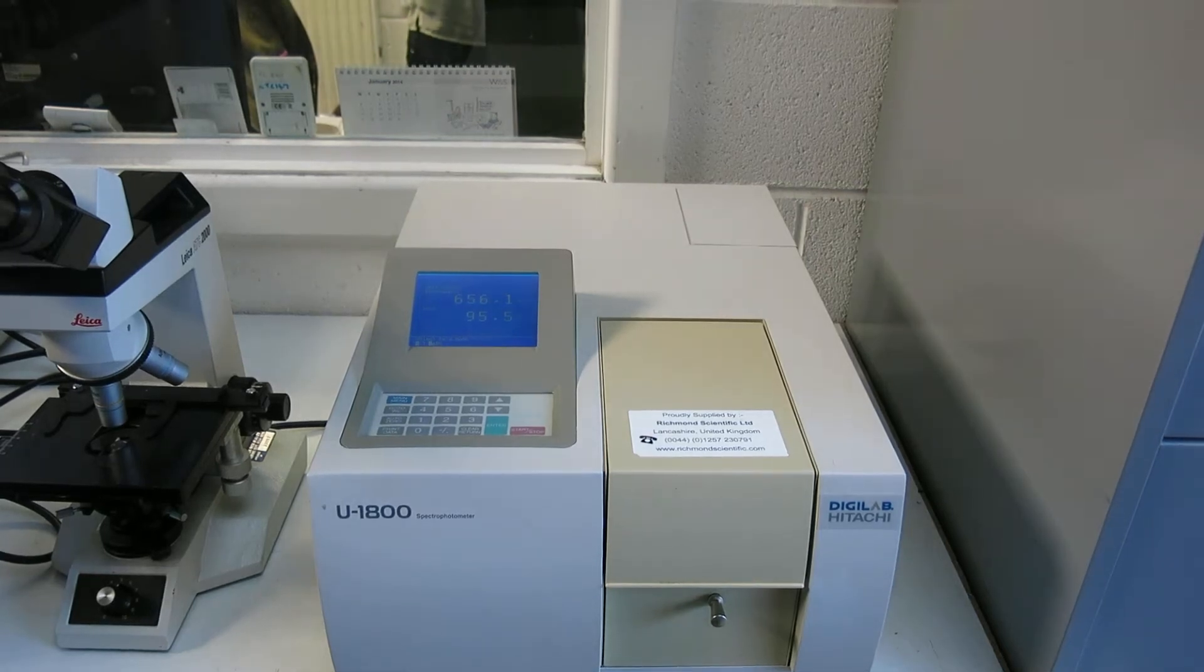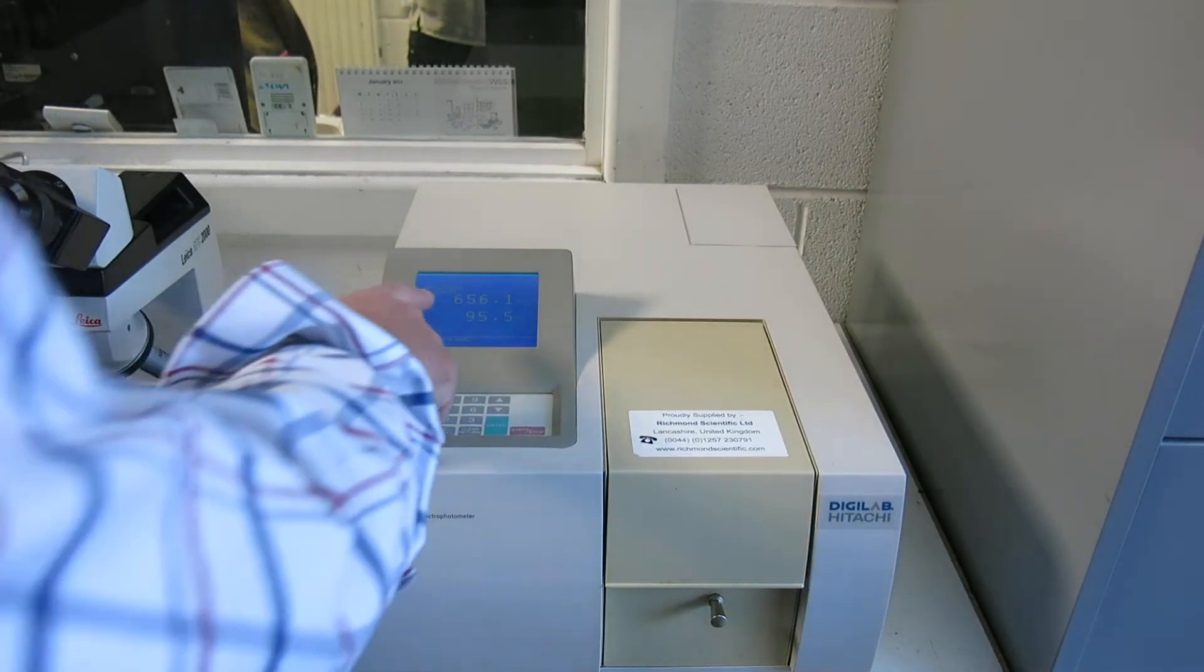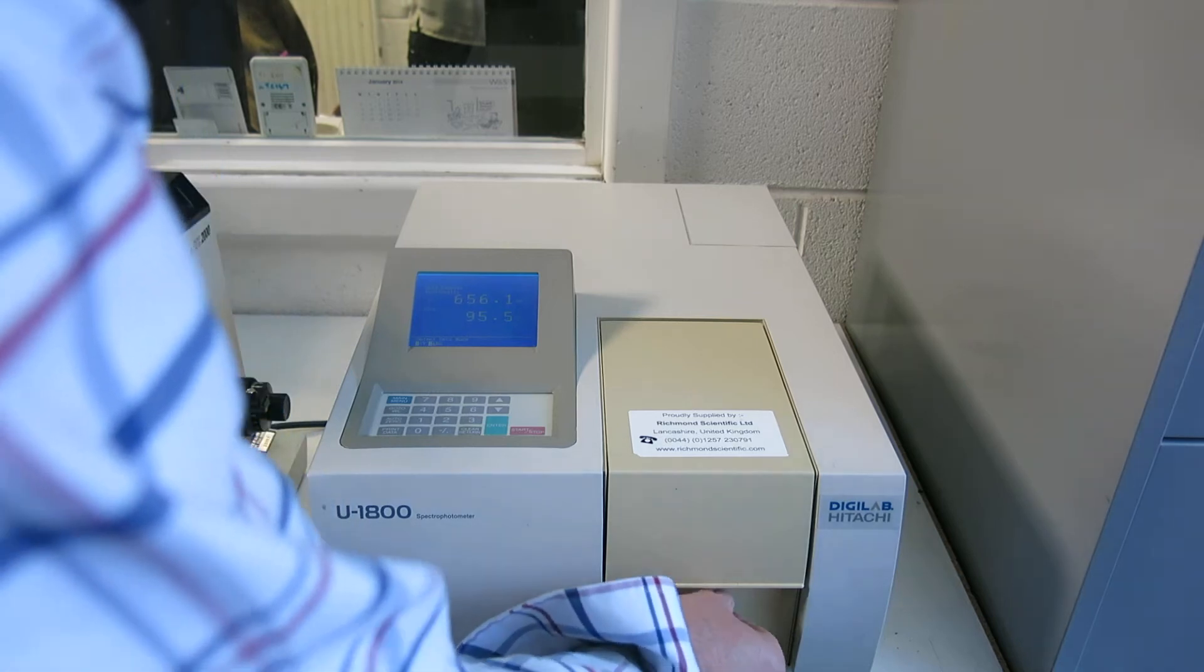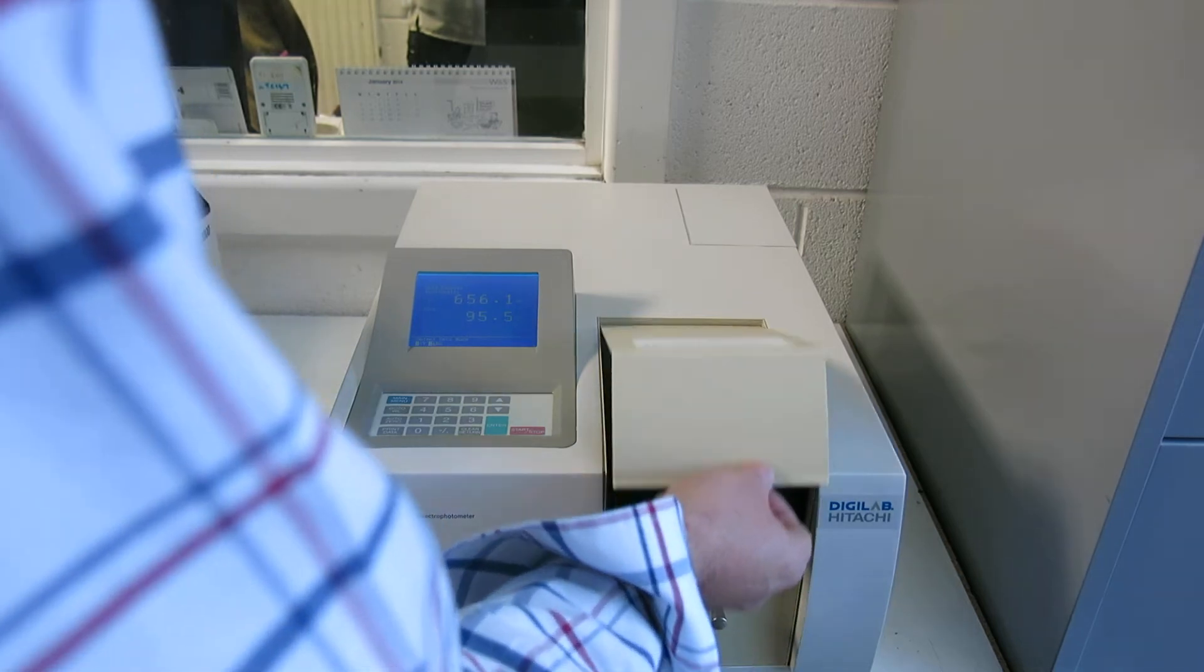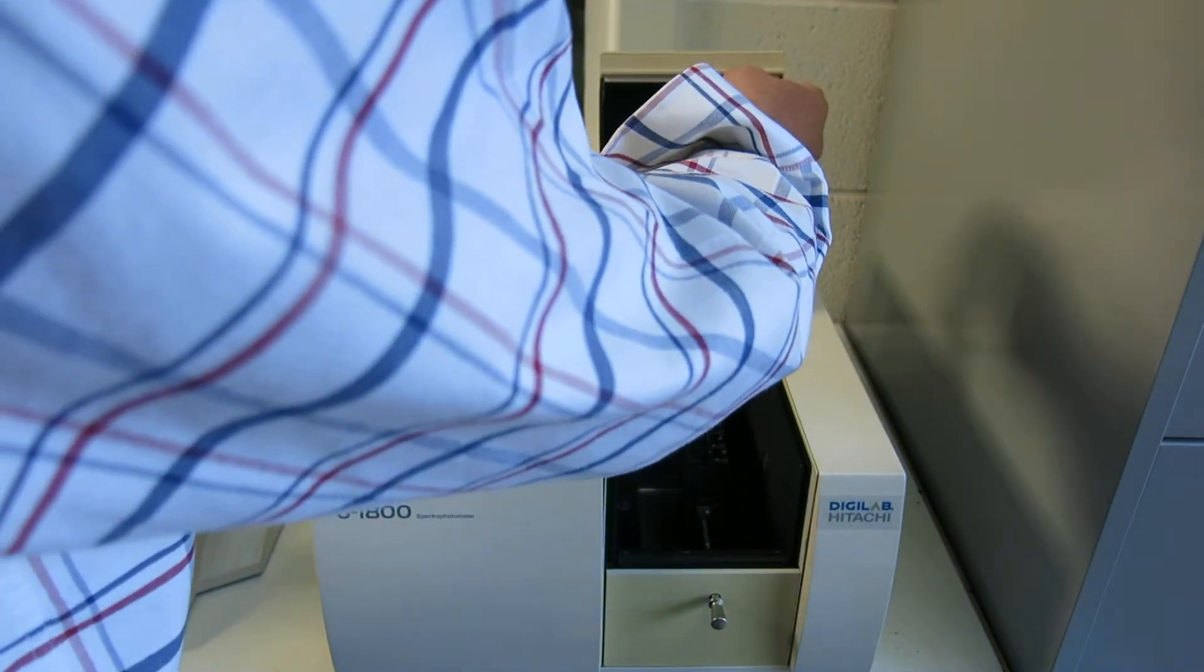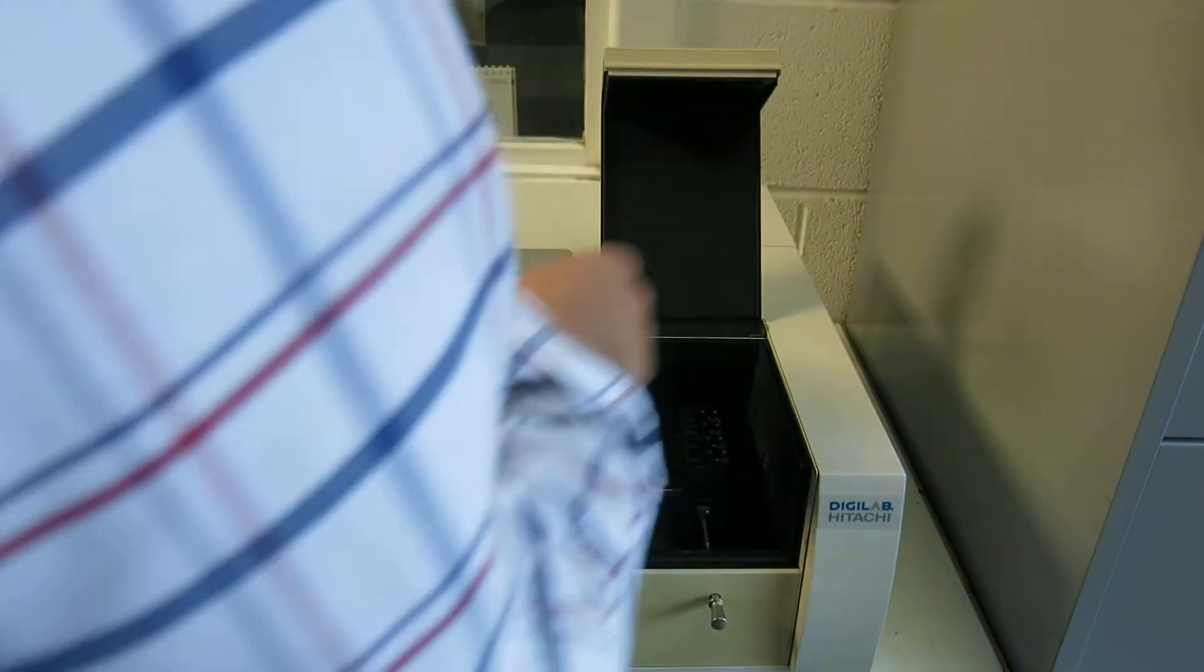This is the Hitachi U1800 Spectra Automata. You can see here there's a display. If you just open the sample compartment here, you can see the display is changing.